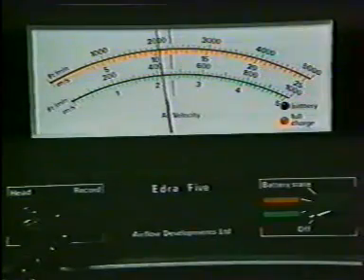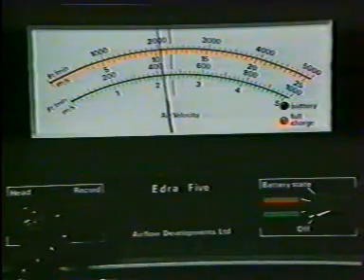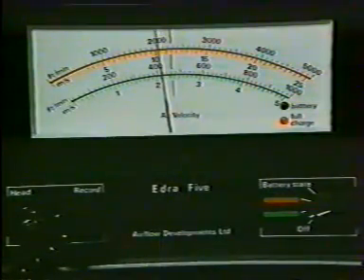The air velocity at the inlet vents is determined using an anemometer or other suitable airflow meter, and the air change is calculated from the known volume of the room. Monitoring of the class of air entering the room and the general environment in the room itself is also carried out using an air particle counter.